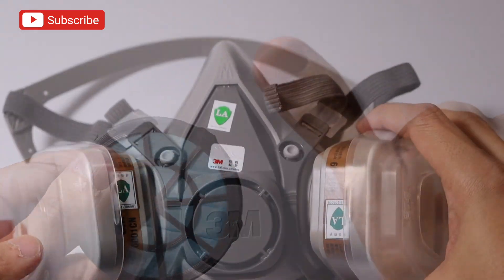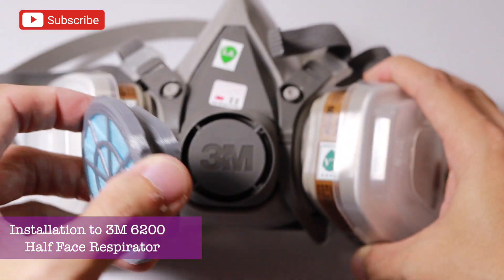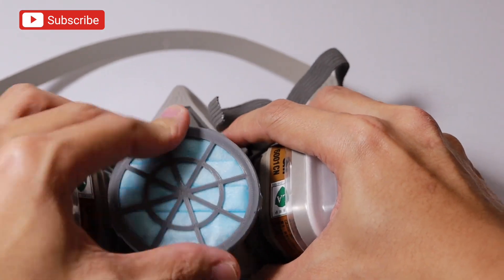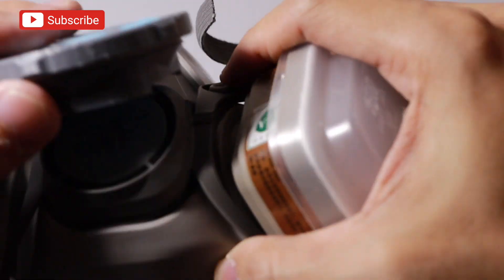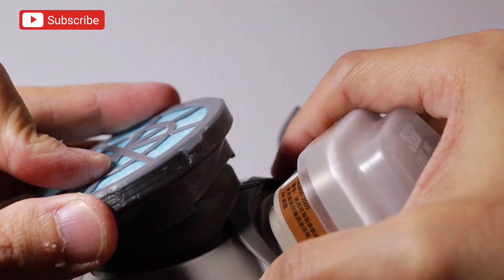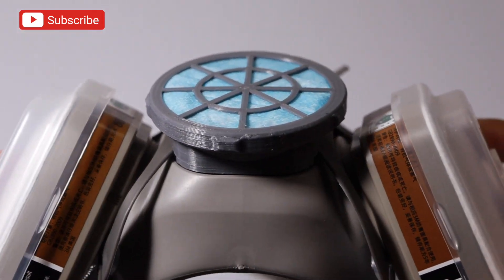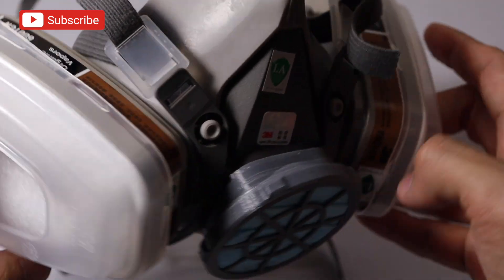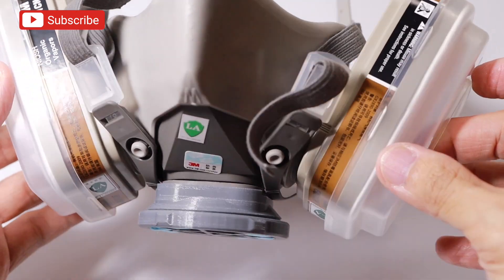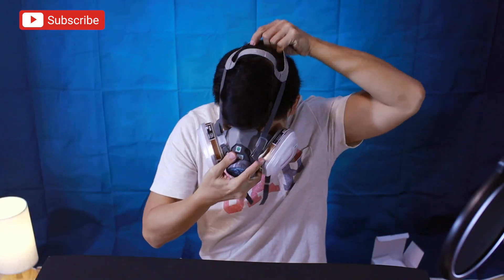To install it — actually, it's just outside the 6200 respirator mask. So madali, mas madali dito sa half-face, mas natanggalin and install. Make sure lang na tightly or snugly fit siya — may click din siya. That's it. Ganun lang siya ka simple ilagay.